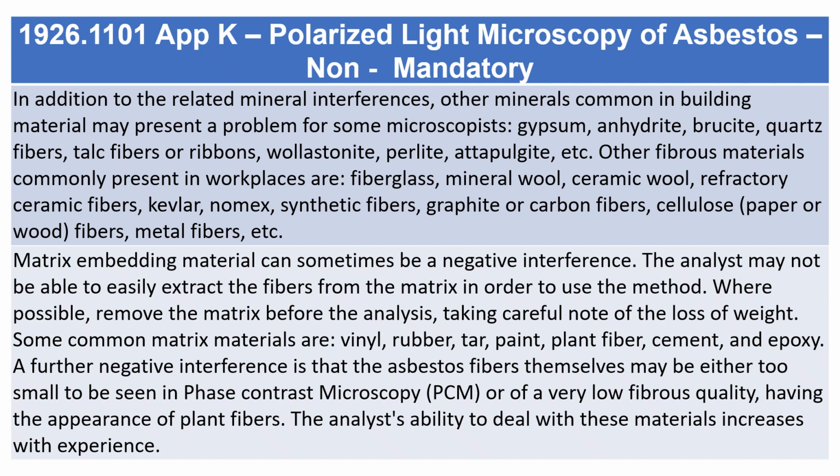A further negative interference is that the asbestos fibers themselves may be either too small to be seen in phase contrast microscopy (PCM) or of a very low fibrous quality, having the appearance of plant fibers. The analyst's ability to deal with these materials increases with experience.